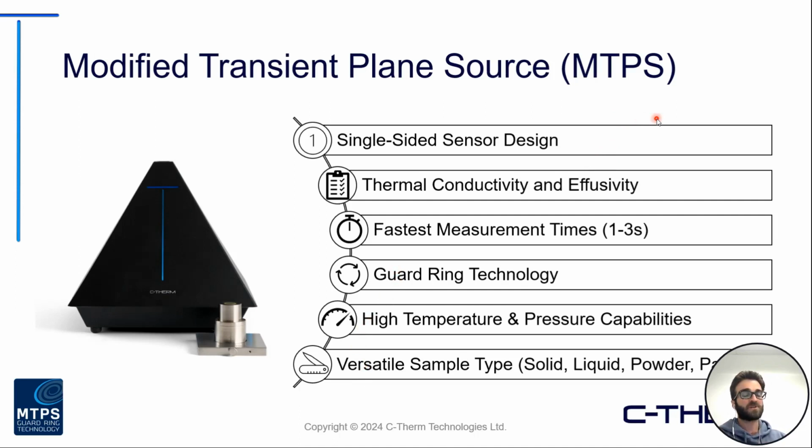So as I mentioned at the top of the session, primarily in today's webinar, we'll be looking at the modified transient plane source, MTPS. I just want to give a few quick points about the MTPS in particular as it relates to your setup, some sample considerations, things of that nature. First off, it's a single-sided sensor design.